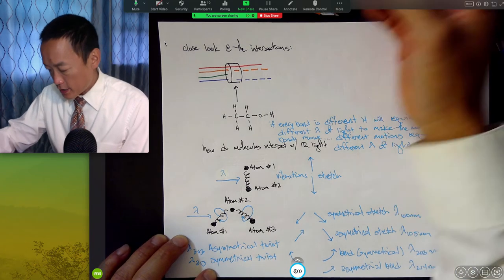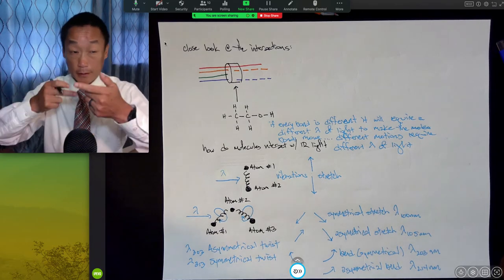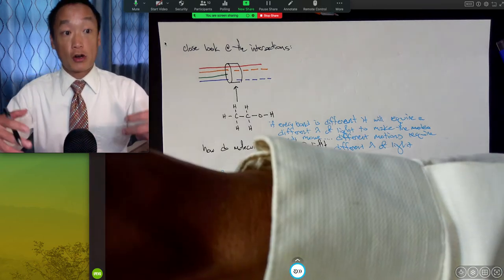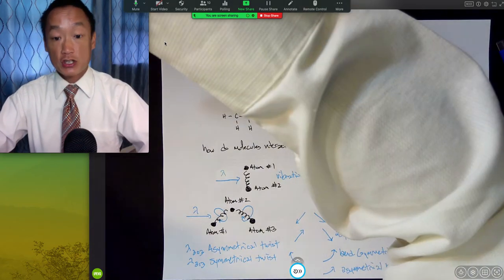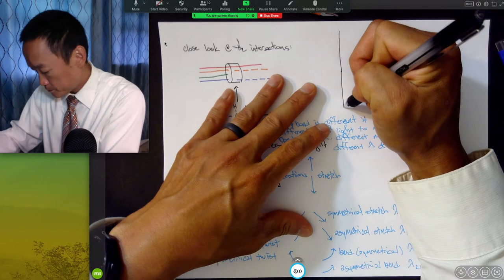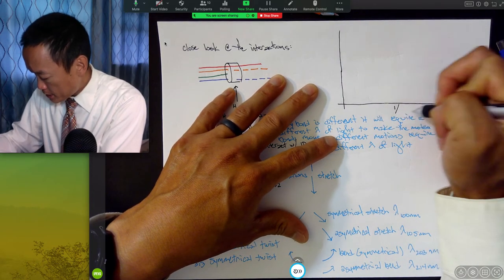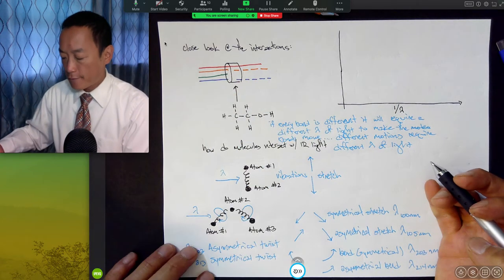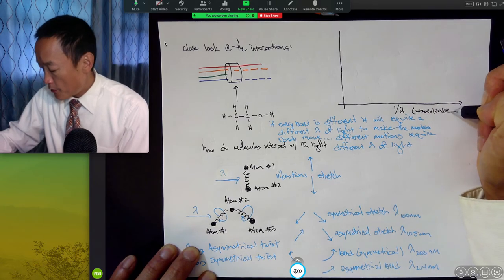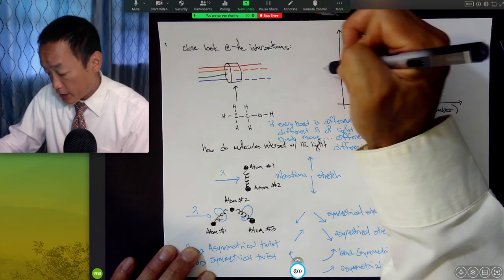So when it hits, then it goes through the prism, and it gets deflected, and then it goes through the slit, and again, I think I flipped those backwards, and then it hits the detector. The computer does the Fourier transformation, and then all of a sudden, at the end of that Fourier transformation, you're left with this beautiful spectrum that places 1 over the wavelength, which is also called the wave number, on the x-axis, and then on the y-axis, you are likely to see absorbance.